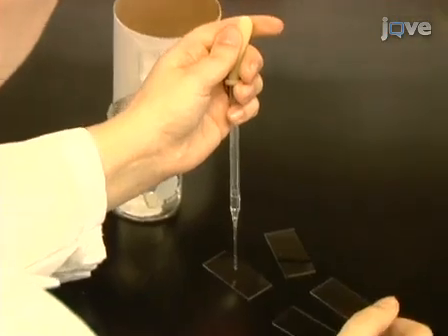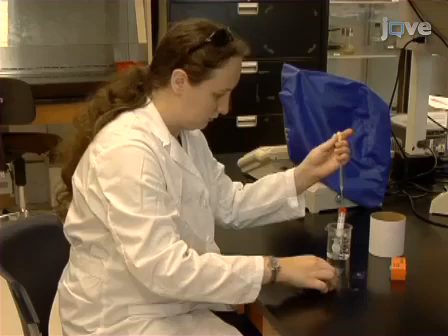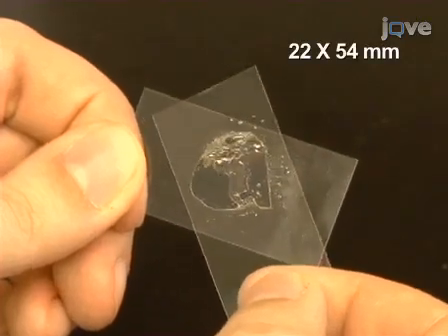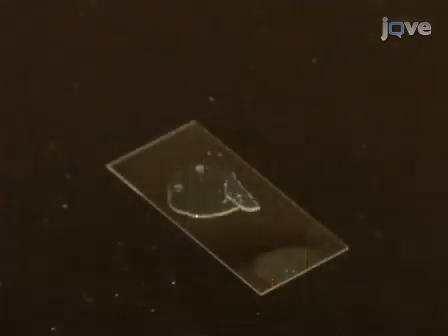Make an injection pad by sandwiching 2 drops of 2% agarose in water from a Pasteur pipette between 2 cover glass slips and applying pressure to shape the agarose into a 1.5 centimeter diameter circle. Remove the top cover slip and dehydrate the pad by placing it in an 80 degrees Celsius oven for 1 hour, or allow it to sit on the bench top overnight.